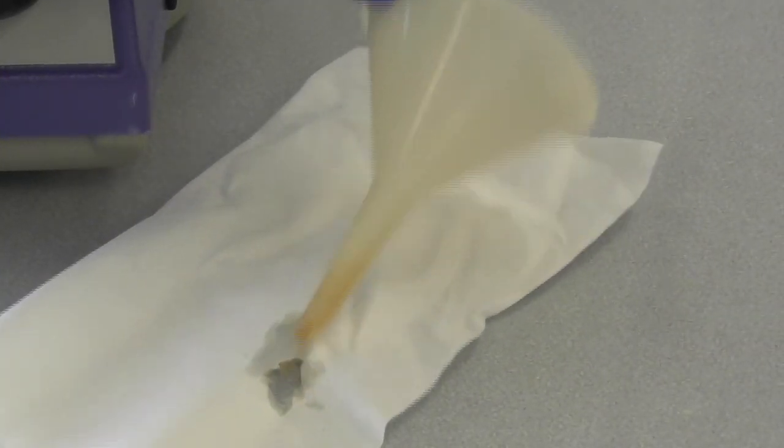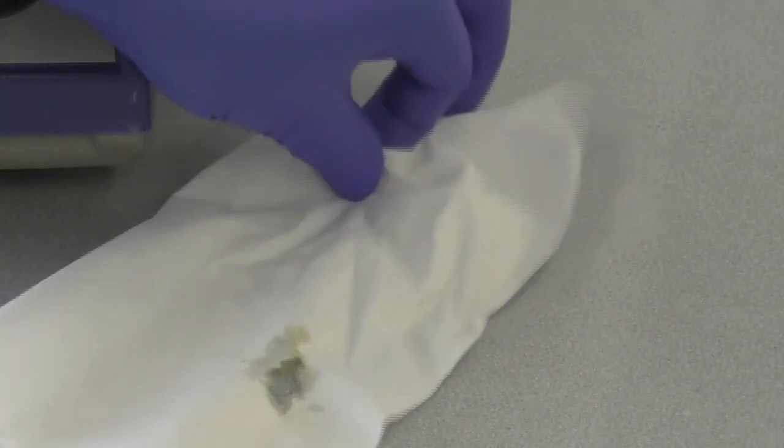Putting the funnel on the tissue on the bench wasn't a good idea, as the concentrated acid has eaten through the tissue and damaged the bench top.